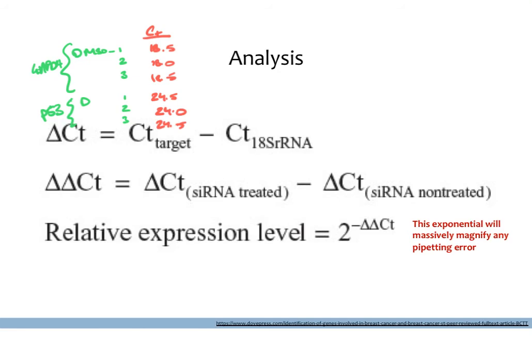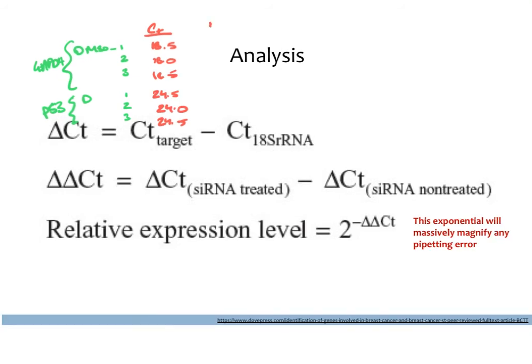as they should be. So once you have this column, your next thing is going to be to generate a column that is the difference, right? Because you want to normalize all of your genes against GAPDH. So this is called the delta CT, or the change. And you want to basically take every gene and subtract the GAPDH from it to really normalize it against GAPDH. So this would be 6, 6, and 6, the way I've done the math. But in reality, you might get something more like 6.2, 6.1, 6.5. Hopefully they're not too far apart, assuming that your originals are not too far apart.